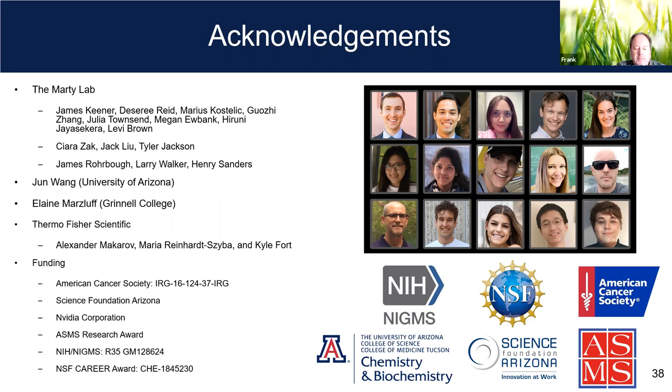Have you seen the new paper from Albert Heck with pulse chasing or frequency chasing, where they get very high resolution? Yeah, I saw that this week. That could be really cool as well. Unfortunately, I think you need access to the transient for that, and they always make you sign a contract before they share anything. I think you have to send it to them and they send it back to you. We tried to see if our instrument could go to really long transients and it would not let us. There are some special lockouts you have to get cleared.